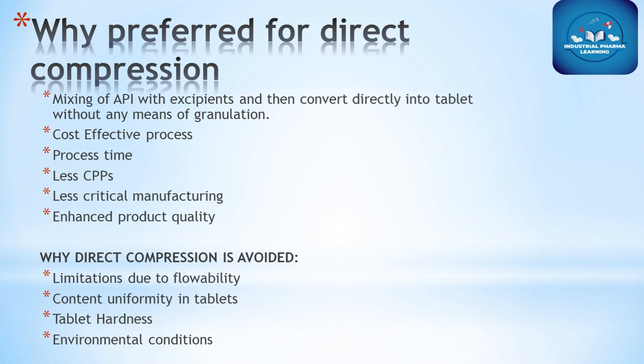Content uniformity issue in tablets. This is another issue where the API is not dispersed properly among the excipients, so we observe another challenge of tablet uniformity. Of course, if there is an issue in blend uniformity, we will observe a content uniformity issue in tablets as well.